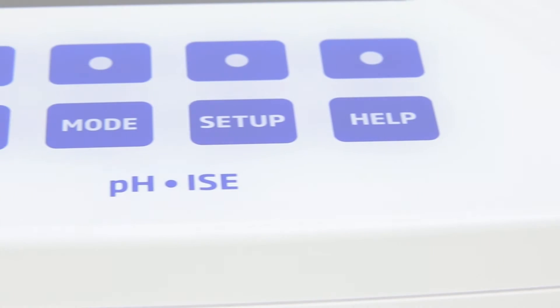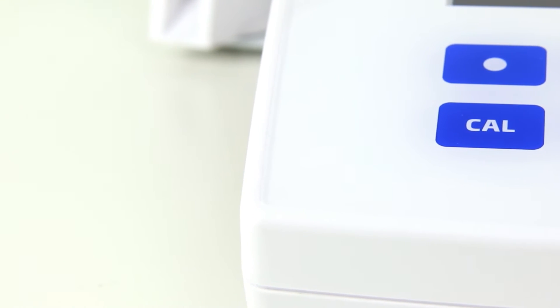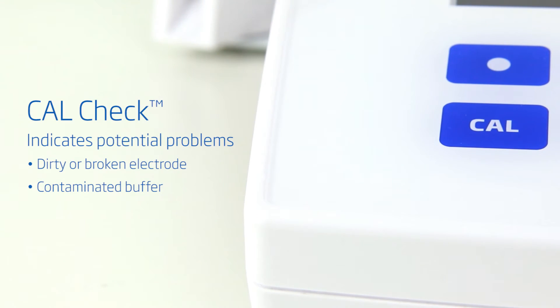The HANA HI5222 dual-channel benchtop meter ensures complete confidence in measurements with the exclusive CALCHEC feature. CALCHEC compares calibrations and indicates potential problems, such as a contaminated buffer or a dirty or broken electrode.